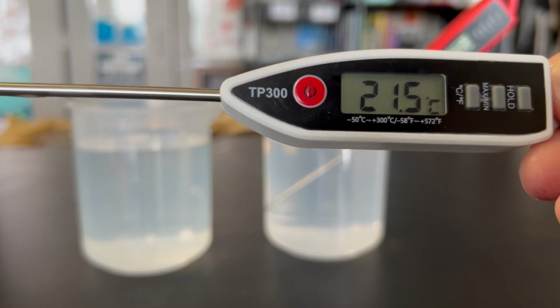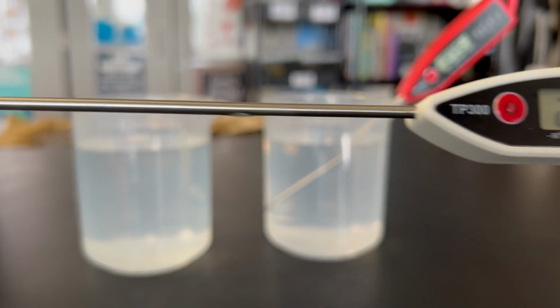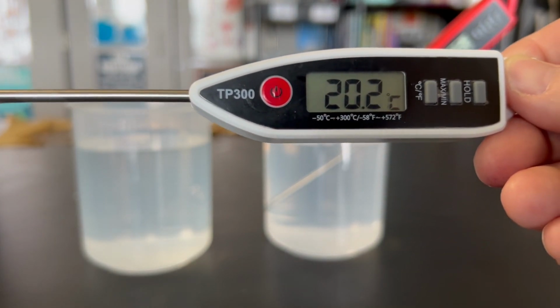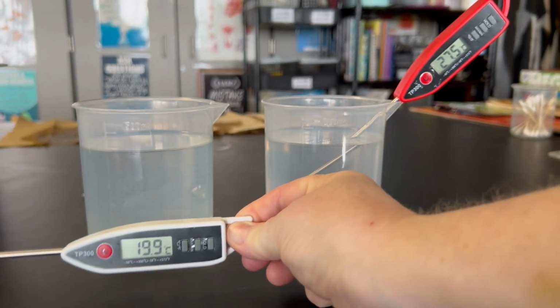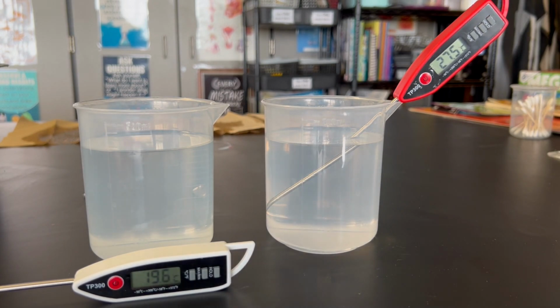Okay, what do you notice is happening? All right, again, I'm not doing anything, simply holding this thermometer in the air after removing it. Okay. I'm gonna set this one here on the lab bench. I'm gonna do the same thing with this one.